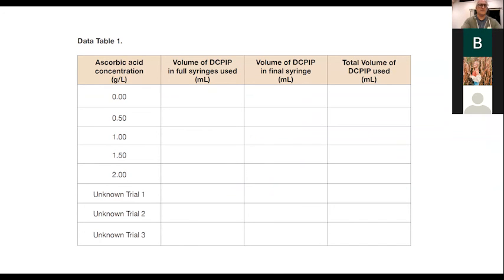So in my instance for the 1, I used like 3.5 mils, I think.